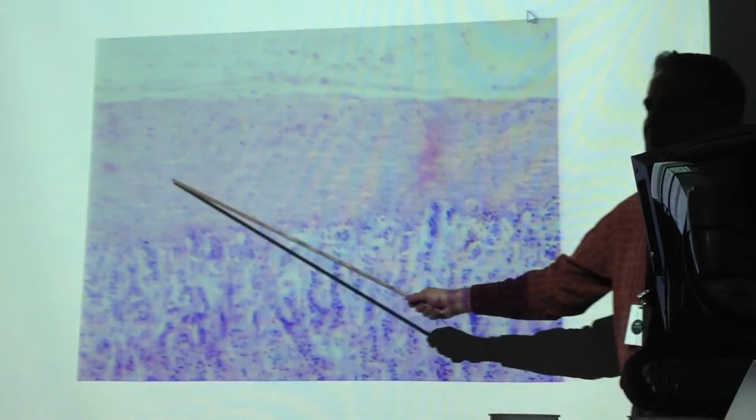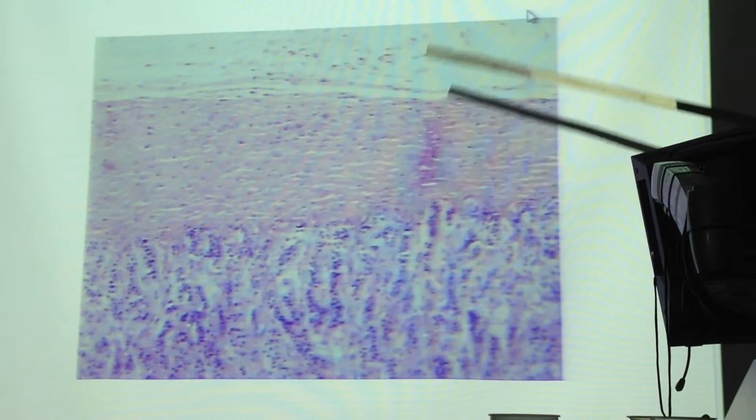Section through the adrenal gland. The first thing you should notice is, like many organs, the adrenal glands have a connective tissue membrane around them. That's the capsule. And again, you see it around a lot of things: lymph nodes, thymus, spleen, kidneys. It supports and protects the organ. So this is the capsule, a fibrous connective tissue membrane.